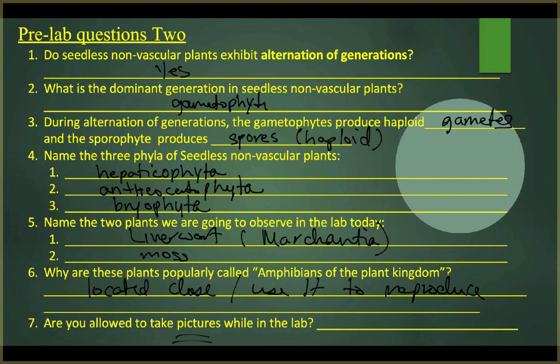You are not actually in a lab class right now. And how these labs are supposed to work, you would be getting essentially a slide, and you would have to look through it, using pictures like we're using here, to identify these parts and answer these questions. And you would do it on your own. The big help is I would be there in case you got stuck or were confused or needed extra help pointing you in the right direction. But unfortunately, that's not the case. But remember, you can always email me or come to any of my sessions. I will answer questions.